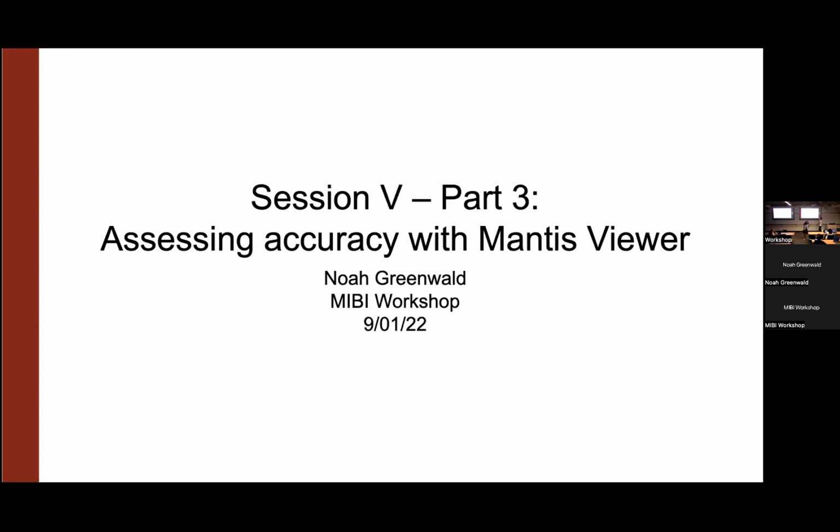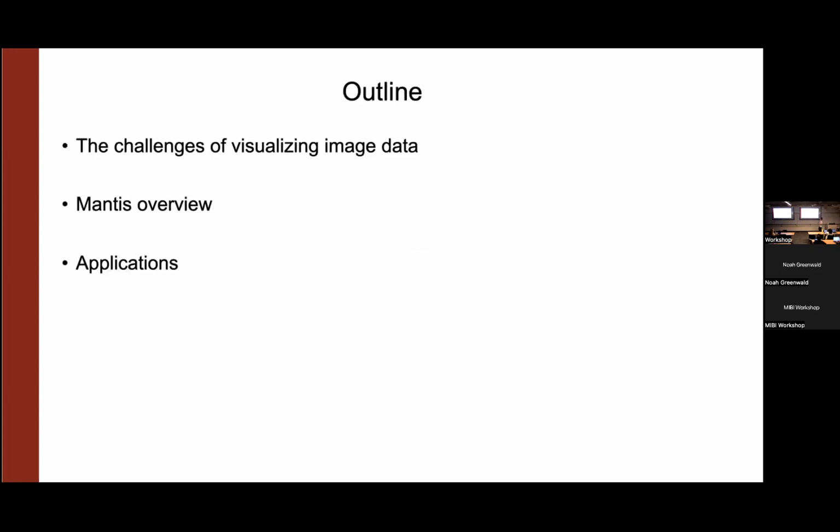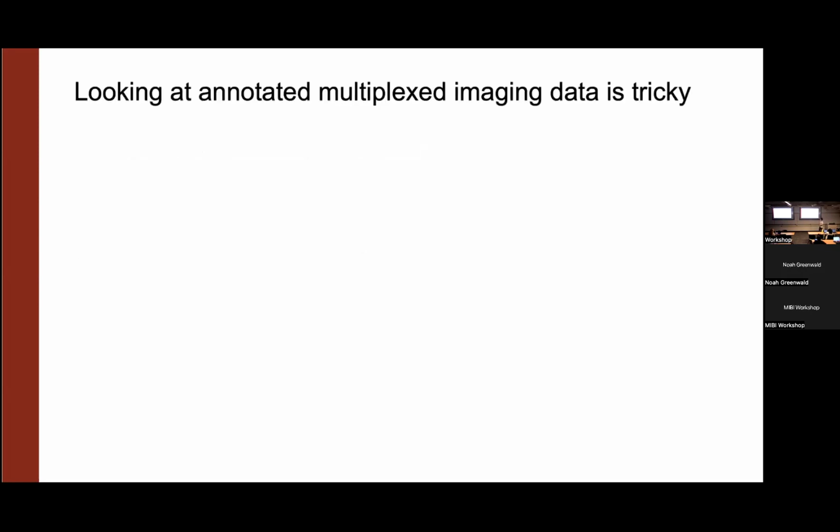Okay, so the second to last talk of this session is going to go through the visualization tools we use to actually assess how our different pipelines are working. So I'll give you just a brief overview of why this actually is hard and deserves a whole talk, then how we use Mantis and some applications.